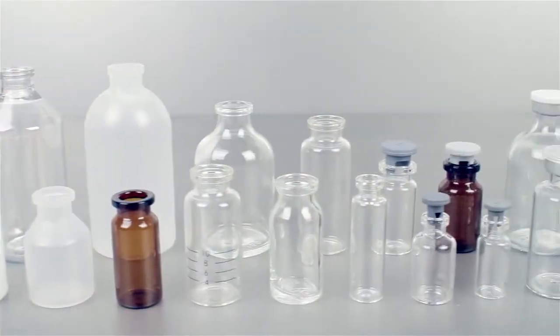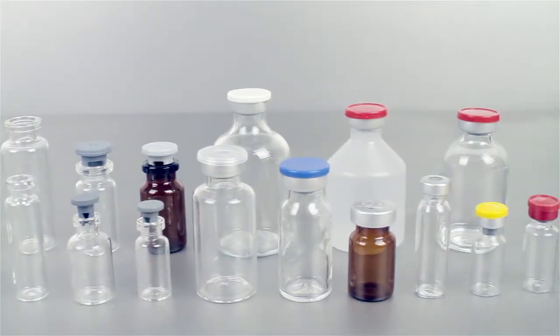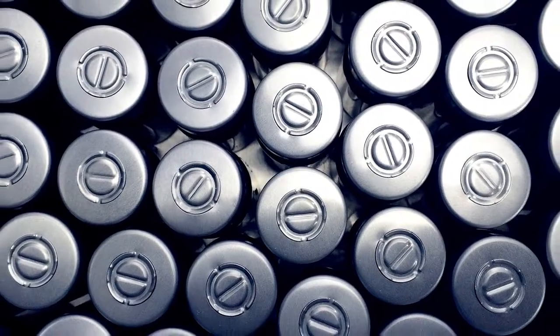Capable of working with many different liquids or fill volumes into vials of up to 52mm in diameter, it can handle stoppers and crimp caps up to 20mm in diameter.